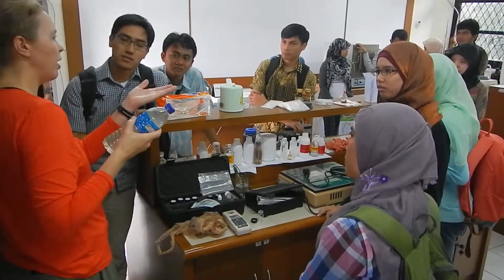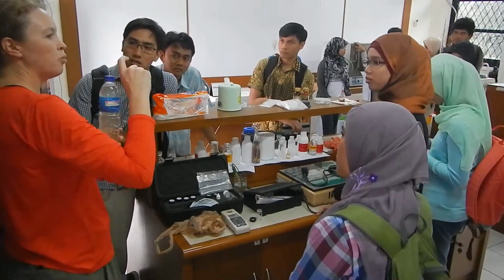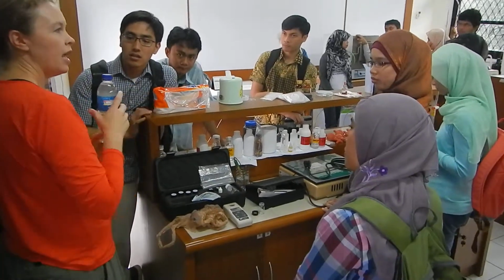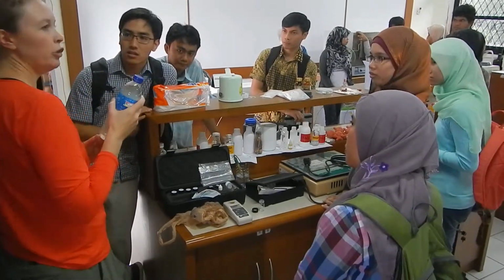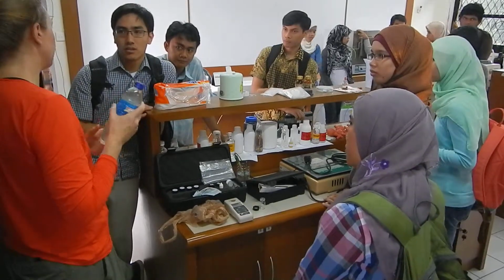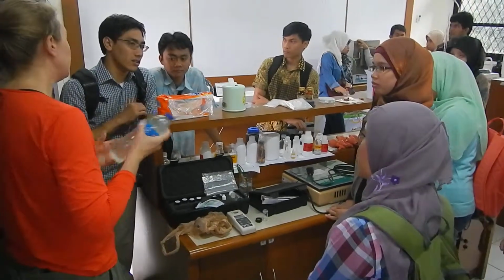I don't know how high your turbidity meter goes, but some of them have a maximum range they can do, and I'm guessing yours is about 800 since it's where your standard is. If it's above that, you need to dilute it. And so usually you'll do a 1-to-1 dilution first, and then you'll have to correct that once you get it back. Because if it's too cloudy, it's not going to work.